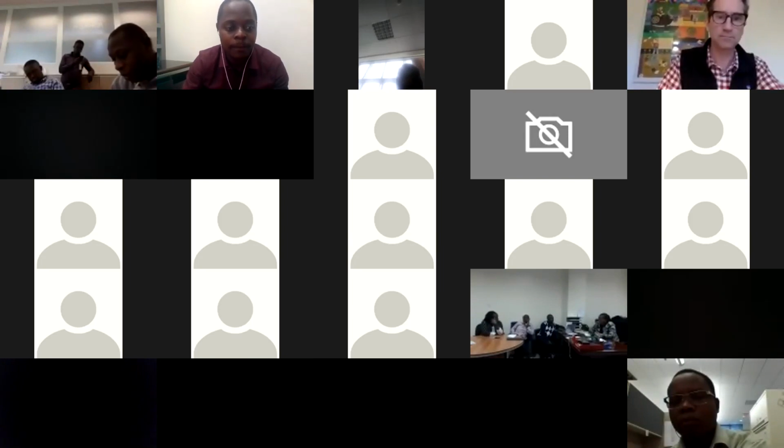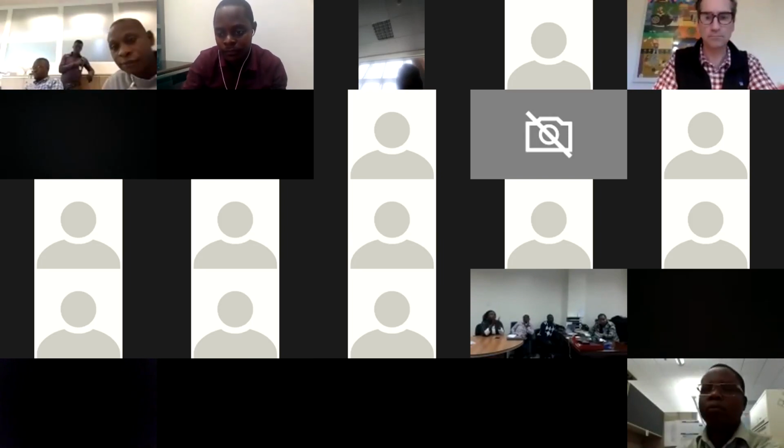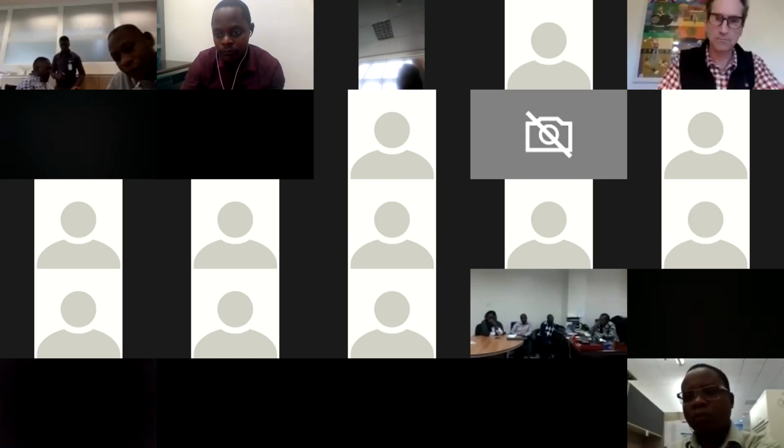Okay, Lindiwe, please, quickly. So the first question, we're saying that the LIMS are too many. They all communicate different results. We have the program one that communicates EID results. The eLABS communicates viral load results, but they are all integrated into one LIS system where all registrations that come in the lab are done, which is the DISA system.